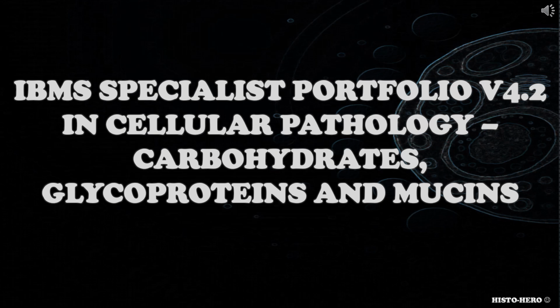And today's video will be about carbohydrates, glycoproteins, and mucins, which is part of the IBMS specialist portfolio in cellular pathology.